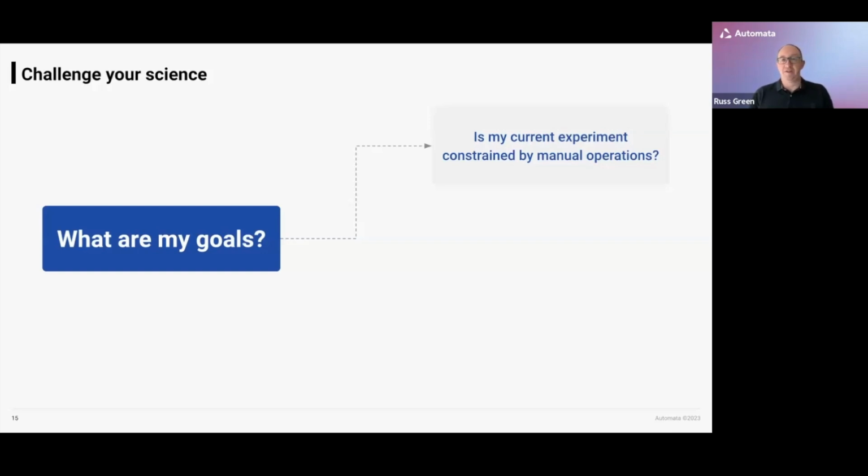We might want to pump in a certain number of clones at one end to maximize the chances of getting really high performing clones out at the other end. And so this might create a scenario which just isn't possible manually. We've probably been thinking about things the wrong way if we've been trying to achieve that manually and trying to hit that goal of upping throughput without thinking about how we might change things to drive automation.